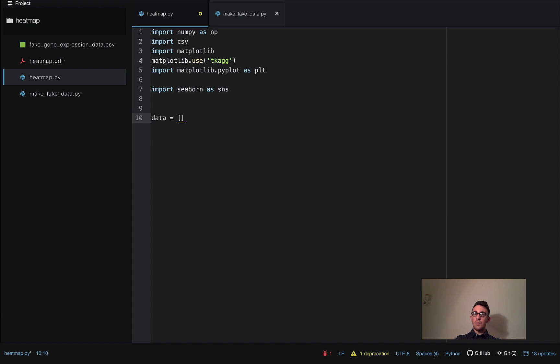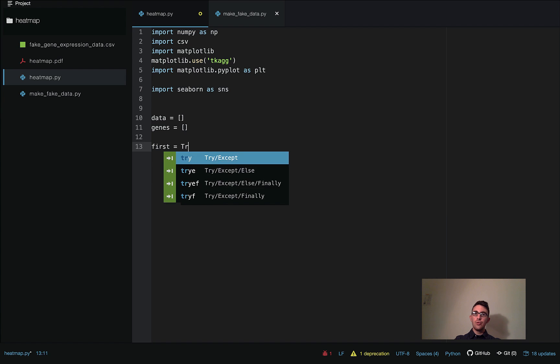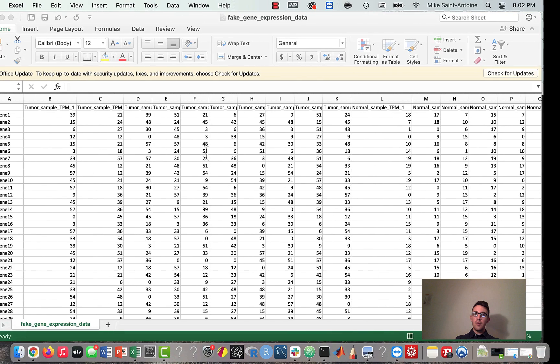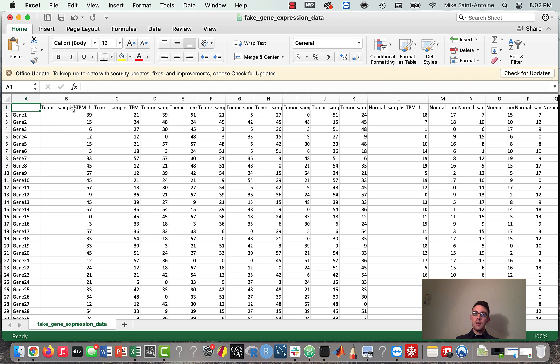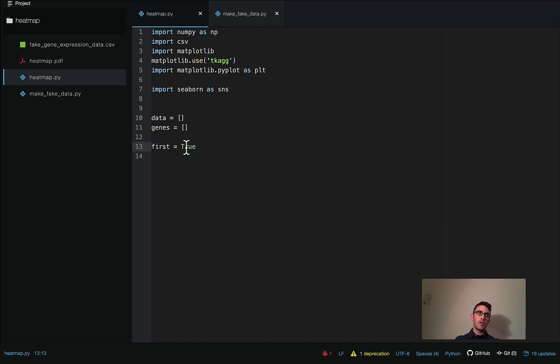We'll have an empty array called `data` that we're going to be appending rows of gene expression data to, and an empty array called `genes` which we'll append the gene names to. Then we define a variable called `first` set to true. This is because for the first row we're reading from the CSV, we're going to treat it specially — it's not actually the data yet, it's just the sample names. We'll use this variable to tell us when we're at that first row and when we're not.